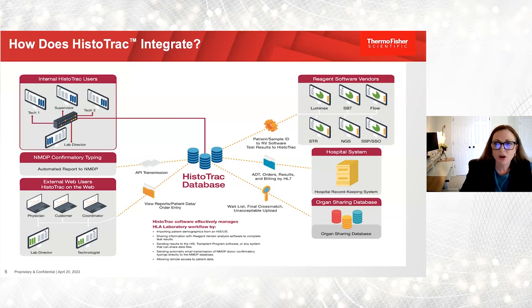In the upper corner here are our reagent vendor utilities. And so this is where you would have performed those assays with vendors or with the vendors' kits, analyze them in their software, and then you're able to import the results from those various analysis software into HistoTrac. And then ultimately from an internal workflow, you'd be able to go ahead and sign those off, review them, make an interpretation, and then send out a report.